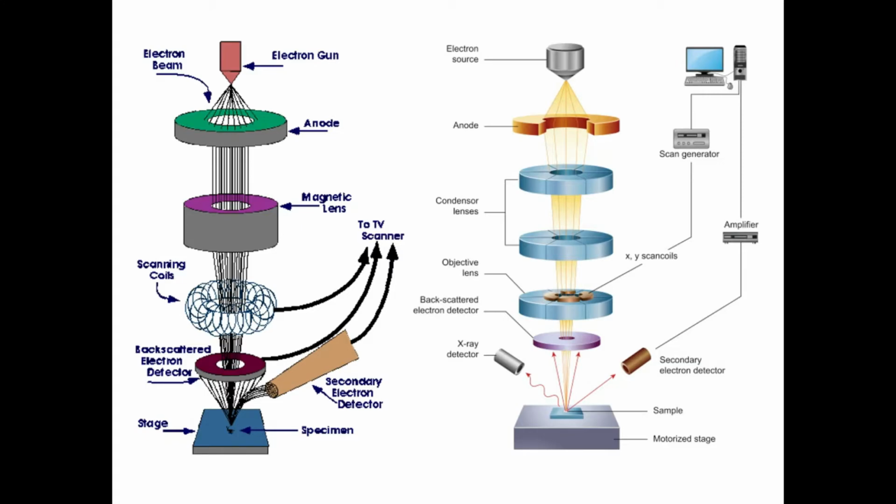So let me check. First, the electron gun. Most probably you should know that electron guns are made of tungsten because it has a high melting point. After that only it is passing through, then it will go through the anode. So the beams are collected and go to the anode.